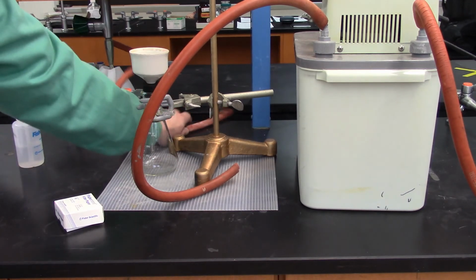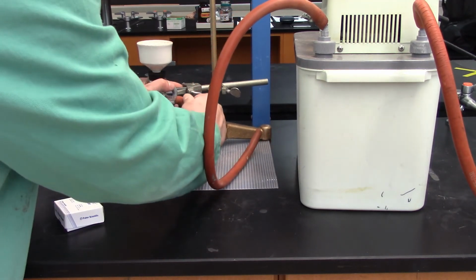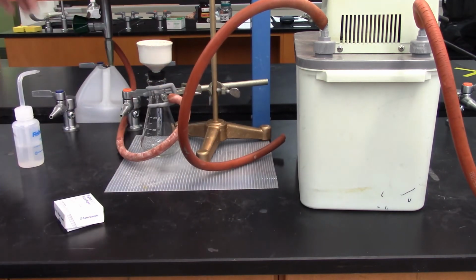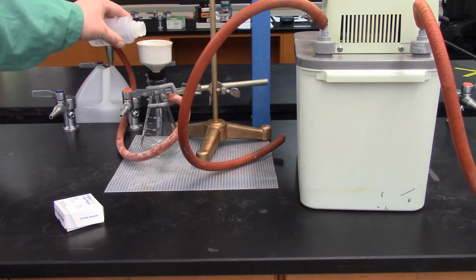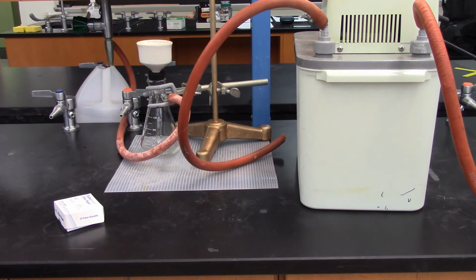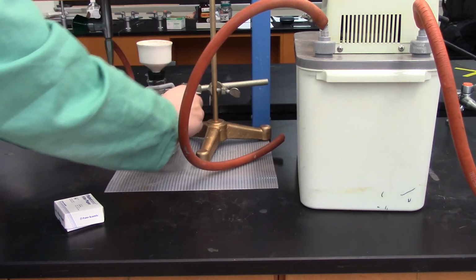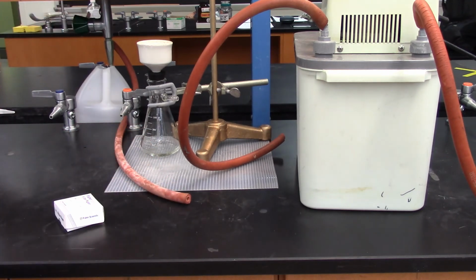So again, just to reiterate, if we're using the sink method with the water, connect the hose and same deal. I'll get my suction source from the water pulling through the aspirator, and then you can see that we get a really nice filter. Okay? So that's what we're doing for our techniques. And again, I'll remind you, see I almost did it. You're going to vent first, and then turn off the suction source.